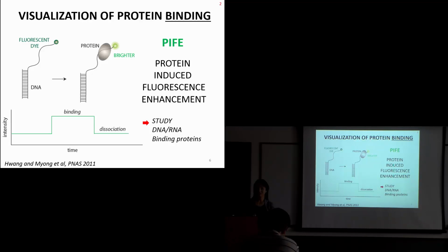This protein, it is said, enhances the fluorescence like 2 or 3 times. So what is the typical size of this protein compared to the fluorophore? And if you did the same thing by using a better fluorophore, is that all that's being enhanced, the fluorescence? You mean, can you go higher than 2 to 3-fold by changing the dye?